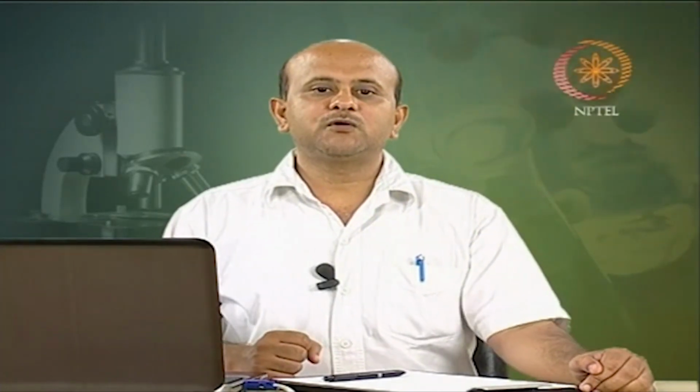All right. So, we will move on to the next technique now, that is mass spectrometry. Mass spectrometry is a technique used for analyzing molecules on the basis of their mass to charge ratio. It is one very important technique for analysis and for different applications.